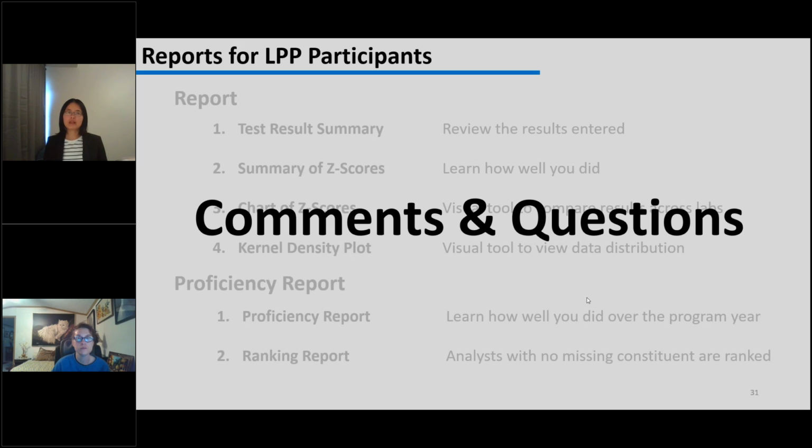You can see that for most of the results we have the summary statistics presented, but only some of them tell us that the consensus value is from a measurement that is really generating closely clustered results. For some results, you can see the results are really scattered. And for those results, I would recommend caution when you use them for any other purposes.